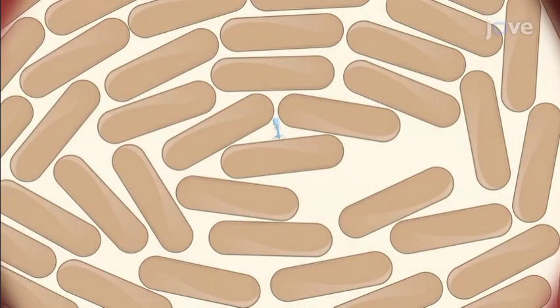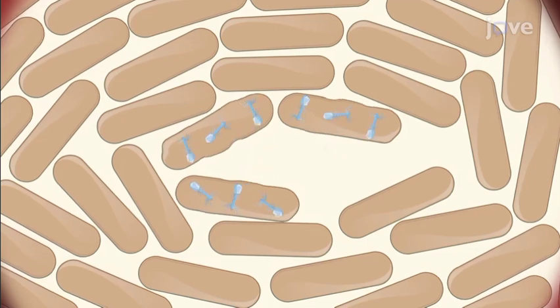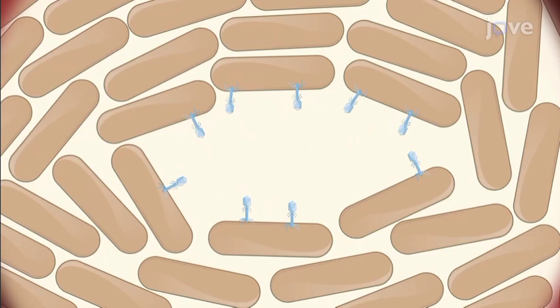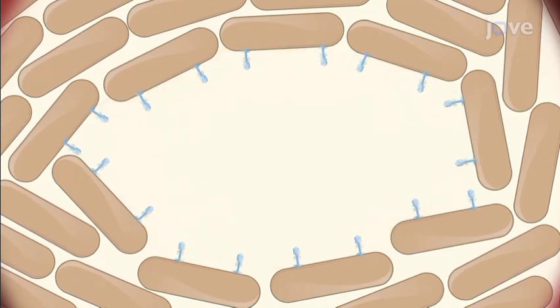However, as phage particles are also present in the soft layer, these will infect and replicate their genetic material within the bacteria, culminating in cell lysis, which releases multiple progeny. These phage progeny then infect the neighboring cells, as the semi-solid state of the bacteriophage layer restricts their movement to more distantly located host cells. This cycle of infection and lysis continues over multiple rounds, killing a large number of bacteria in a localized area.